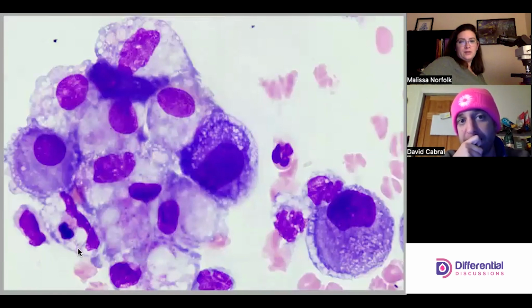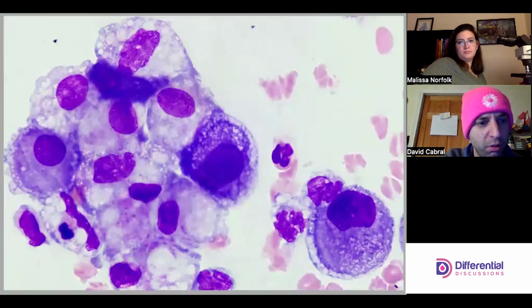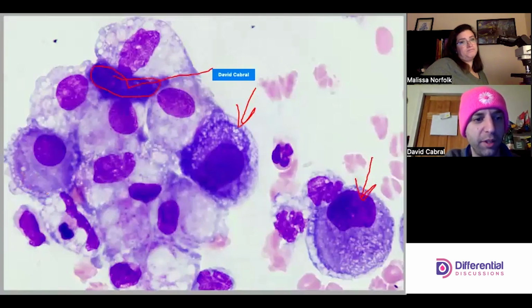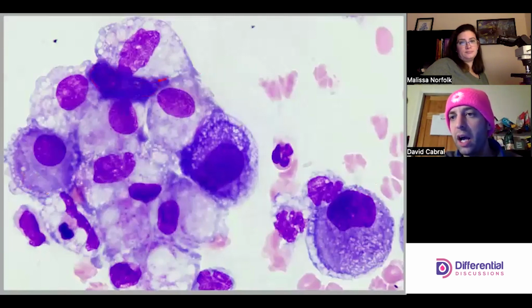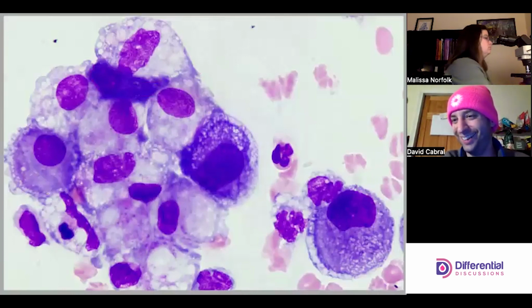Yeah. And looks like again, phagocytosis there. Oh, cool. Good eye. I missed that. Yep. So it looks like where Melissa just pointed out, a neutrophil being ingested by probably a macrophage. Looks like it. And then this might be a normal meso, right? Yeah. But then we have more of these kind of ugly fellas. And then what's going on in that area up there? So again, most people are going to struggle with enumeration here, but don't get lost in that. It doesn't really matter.